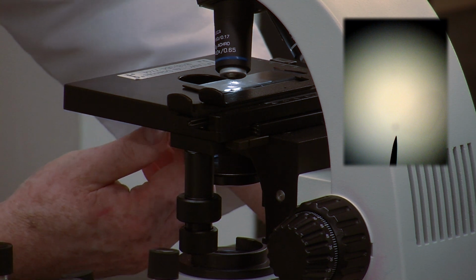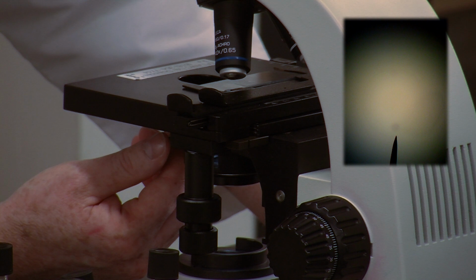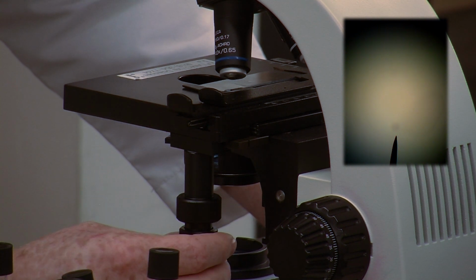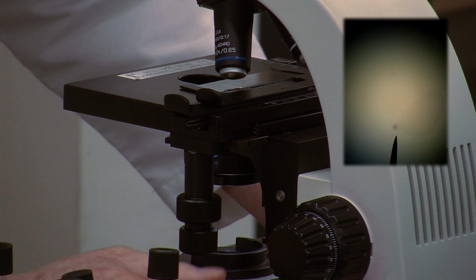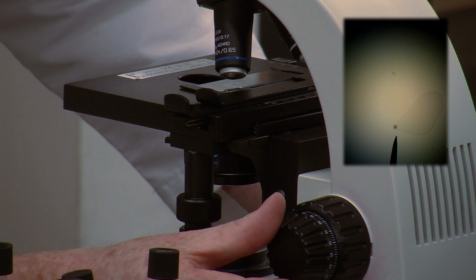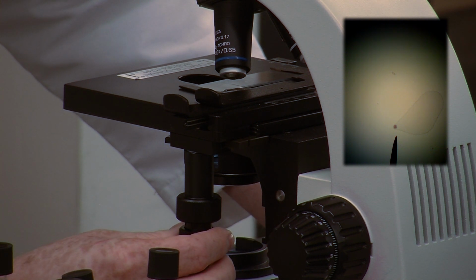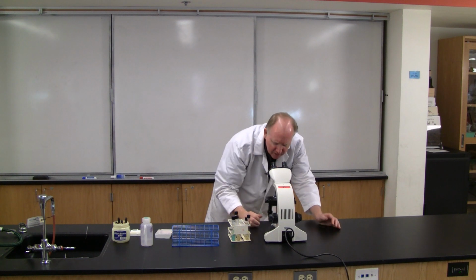And also, this is where you're going to want to adjust your diaphragm. So you want to close it almost all the way. And that'll give you sufficient contrast so you can actually see the bacteria. So I'm focusing on the edge of a bubble here and centering that. And now I'm ready to go to oil immersion.